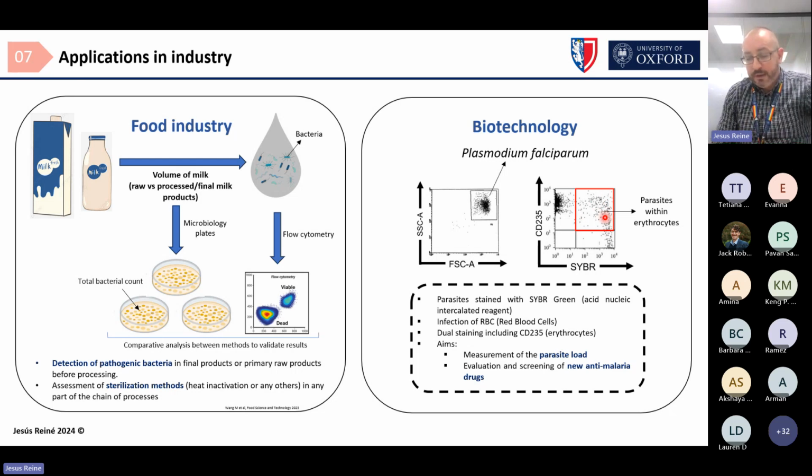That's also very good because we can define new ways to eliminate or neutralize the action of the parasite inside the erythrocytes using different drugs, and we can compare them with a very basic approach. Like I say, the industry applications are quite routine and there are a lot of them. This is only a few of them.